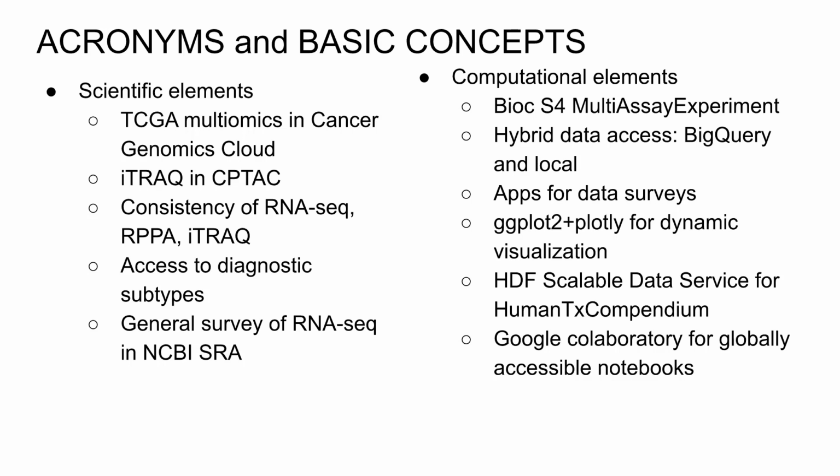We'll talk about it from a different quantification perspective, iTRAQ. I don't know much about iTRAQ, but maybe you guys who are studying proteomics do. How many people use iTRAQ quantification? A fraction of you. So this is something which some of you are going to have to help us understand better, because I don't have a rich understanding of it. It's not absolutely critical that we understand it completely, but what we're going to say is we have some iTRAQ ratios that have been collected on a number of tumors. We're going to assemble them and try to interpret them in certain ways. So RPPA, I mentioned to you, RNA-seq is looking at messenger RNA abundances in tissues. We're going to only talk about bulk RNA-seq here.